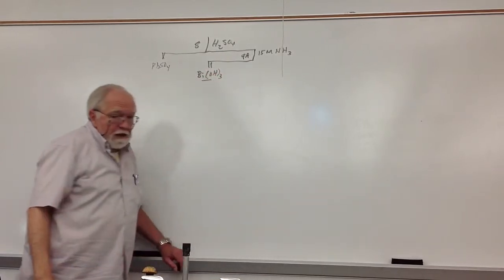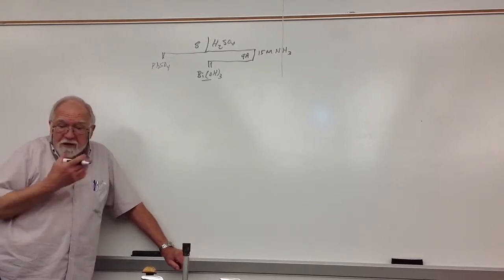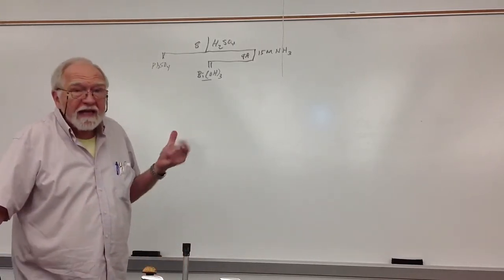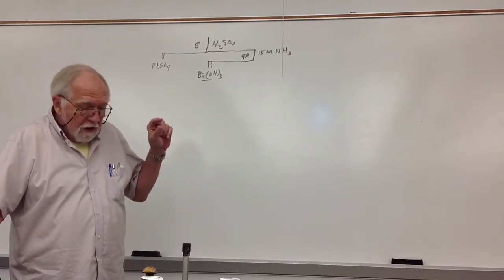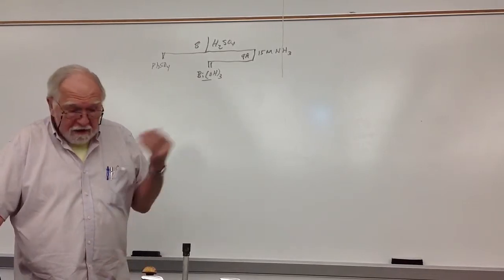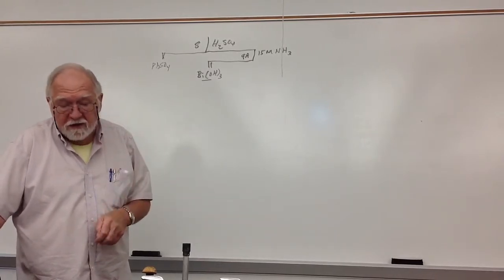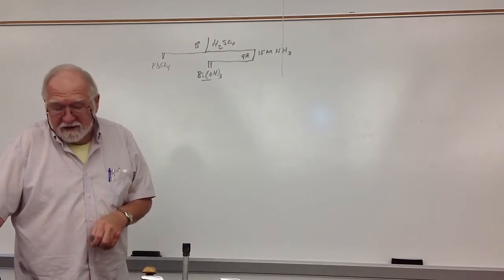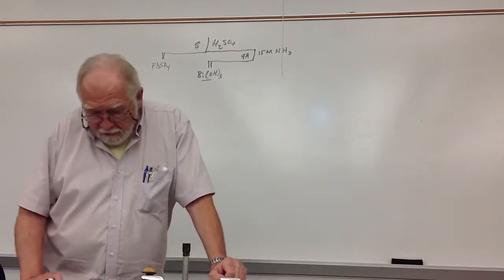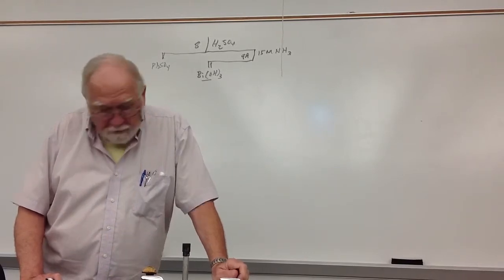This is that white precipitate I already talked about. I even wrote a net ionic equation. I said it's difficult to see because up till now, whenever you added something, you made a precipitate, the whole test tube turned cloudy. Now it might turn hazy, or if you have a small amount of that bismuth hydroxide, you might not even notice the haziness. So I said, you're not going to see a precipitate form like you have previously. You always centrifuge it and look in the corner of your test tube for some little gelatinous lump of material. That's your precipitate of bismuth 3 hydroxide. Okay. The confirmatory test then, centrifuge, decant, save the decantate for procedure 10.